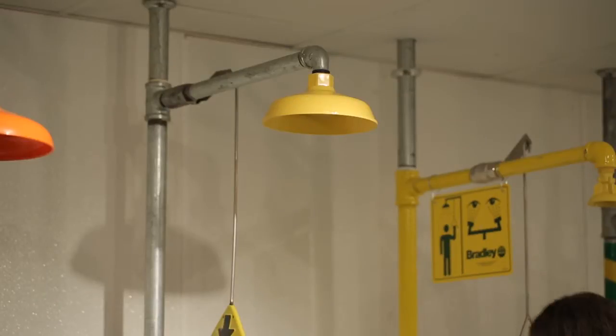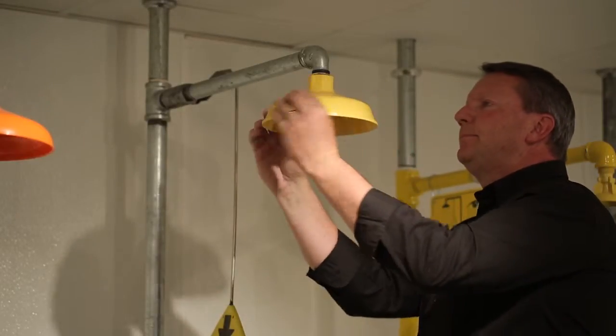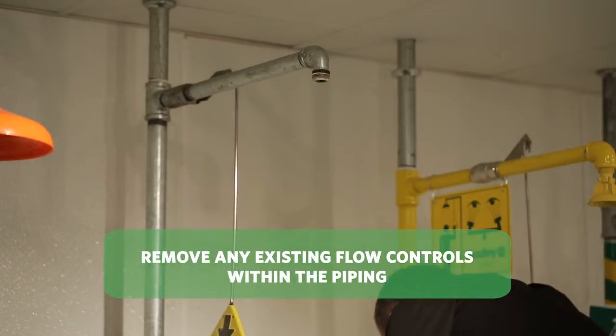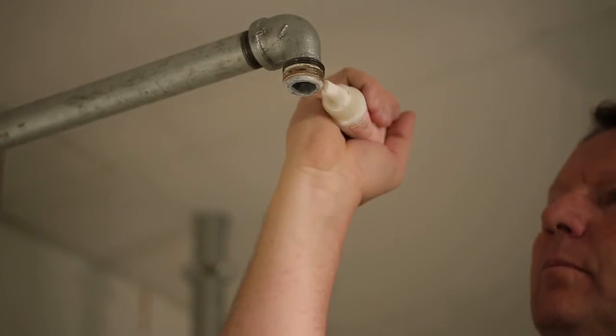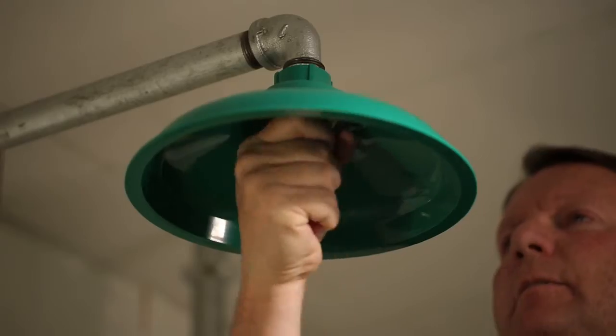For those with the shower head kit, start by twisting off the existing shower head. Most shower heads will easily twist off, but if you come across a tight threading, utilize the adjustable wrench to assist. Then apply sealant to the shower head supply and twist on the AXION Advantage shower head clockwise.